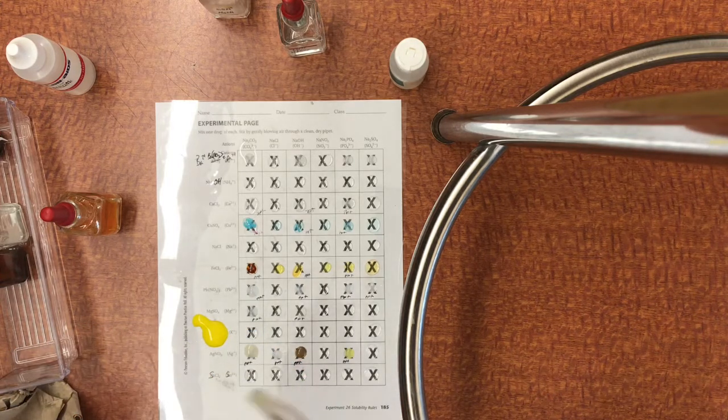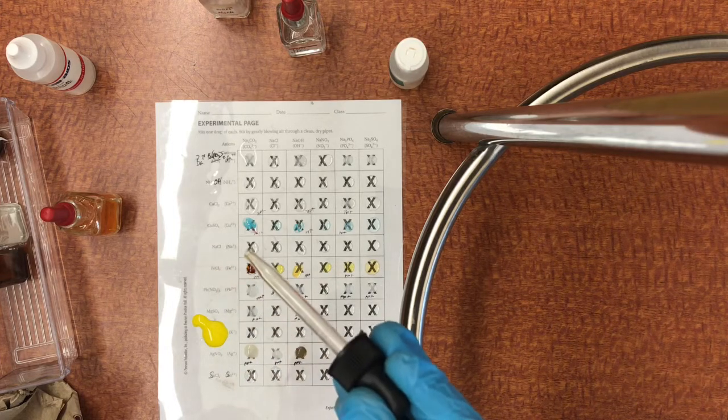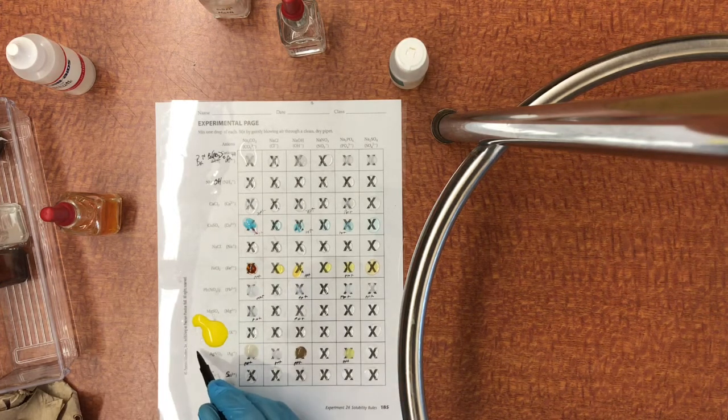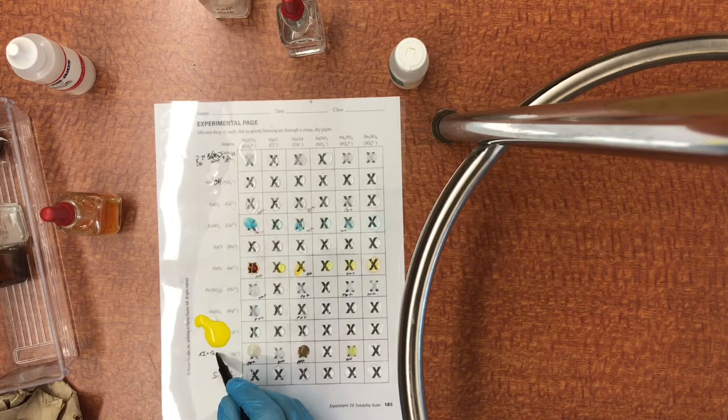Okay, so it actually was fast enough that it went up inside of the pipette. So that chemical reaction is very strong, very fast. You can see how strong and yellow that is. That's the reaction of potassium iodide plus lead nitrate. So KI plus lead nitrate.